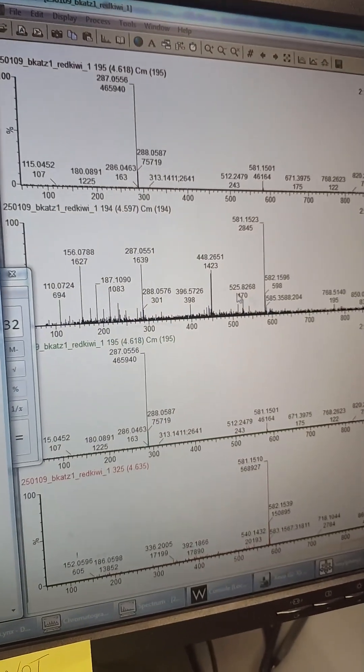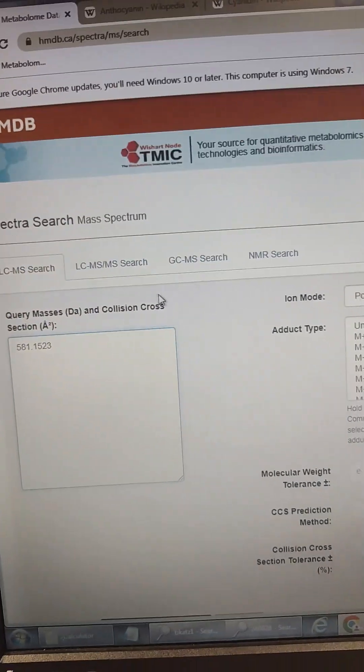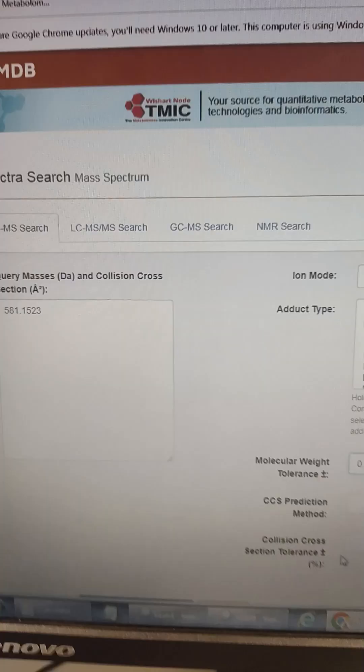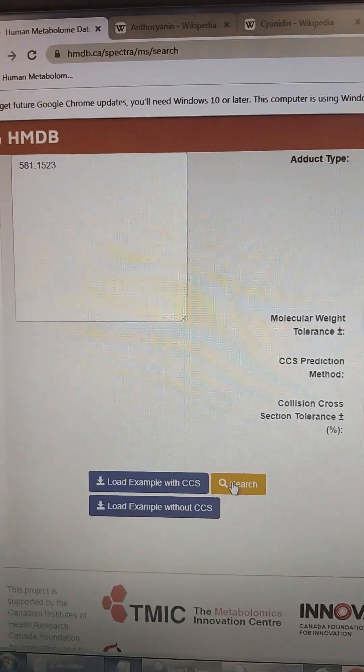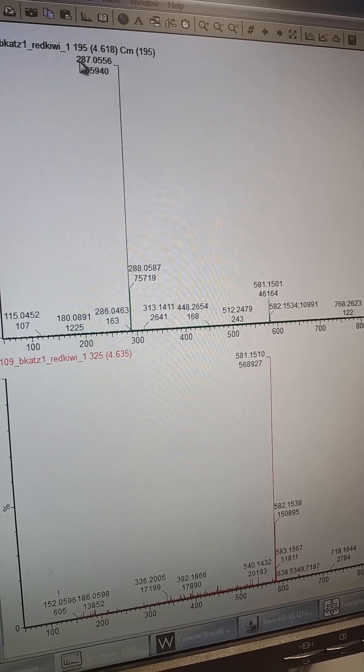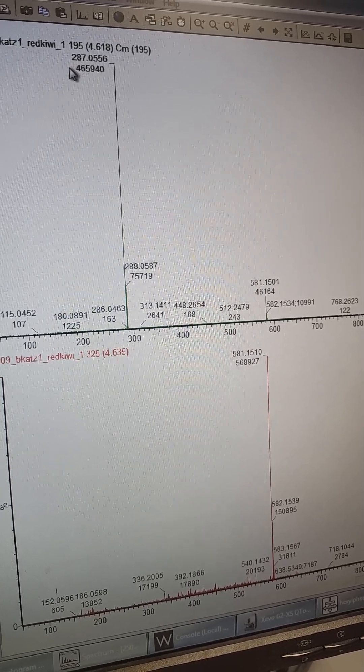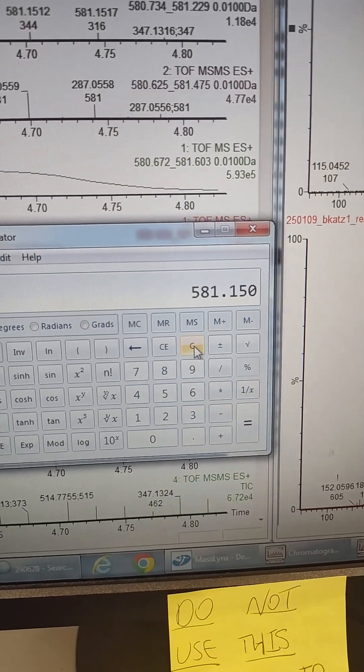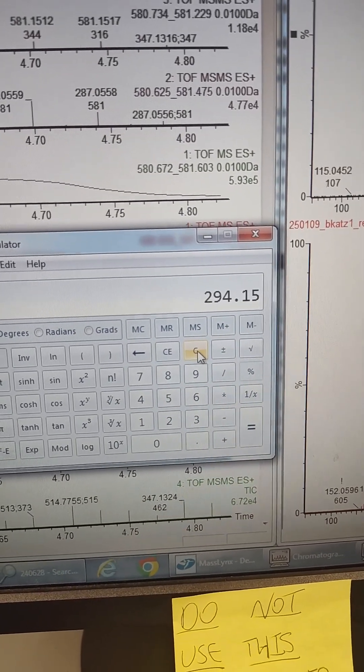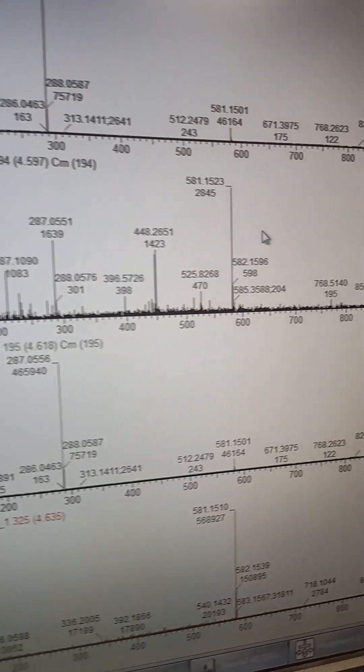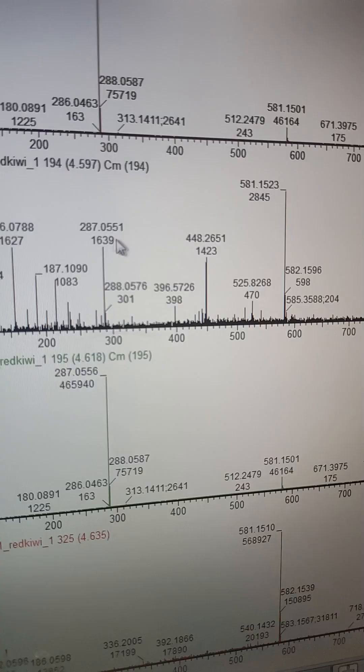So it's a cyanidin base pigment. So now when we search it in HMDB here. We know we're looking for cyanidin based anthocyanin with a 581 mass. And that's going to be a shift. 581 minus 287. So that's 294 shift. So this fragment channel looks like it did a little bit better job. There's our 581. We have the 287. Then we got the mass that's missing in between there. 448.